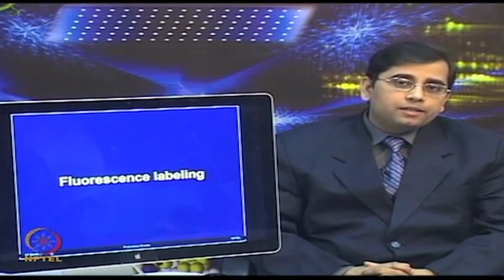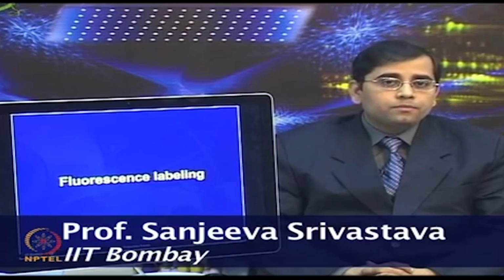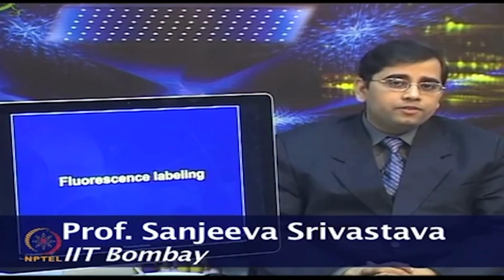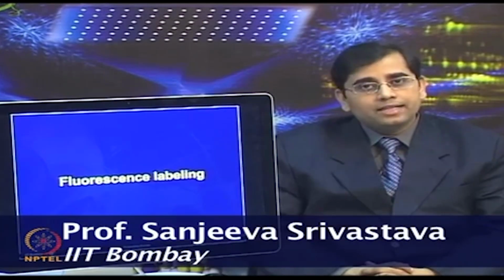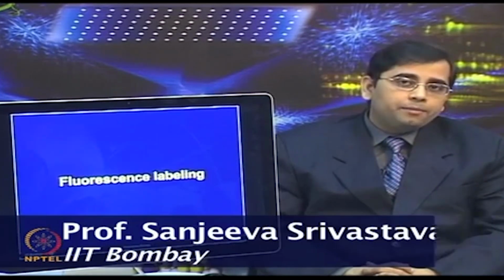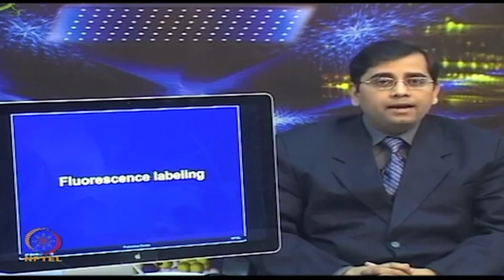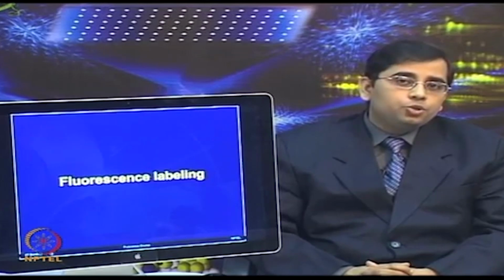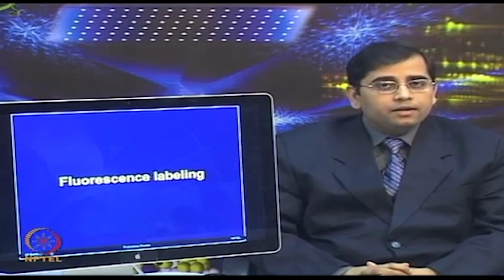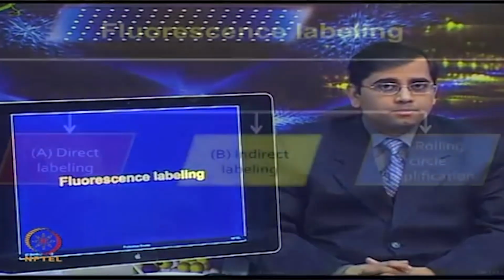The fluorescent labels can be used to tag the probe molecules which bind to the analyte of interest on the microarray surface. The excess fluorescent label can be washed off from the microarray surface, and the fluorescence from the binding interactions can be used to identify as well as quantify the target molecules.